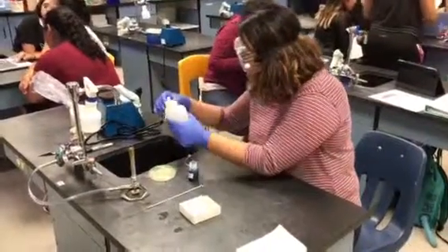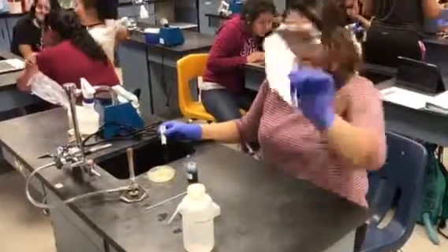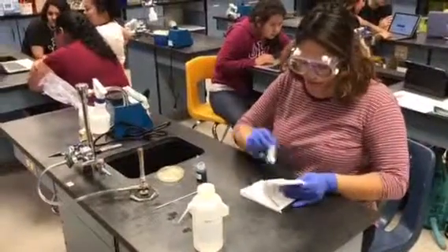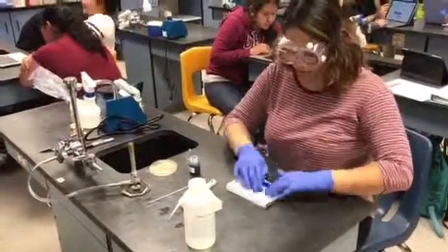Once you are done rinsing your slide, you can either let it air dry or you can use bibulous paper to dry it. You just put it between the sheets and press down softly so that you don't break the slide, and that will dry your slide.